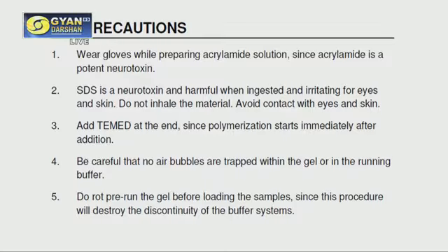TEMED should be added at the end, because polymerization will start immediately. And when you are pouring the gel, this is another very important point. Make sure that no air bubbles are being trapped in the gel. Otherwise, they will interfere with the running process. Do not pre-run the gel before loading the sample, because this procedure will destroy the discontinuity of your buffer systems.